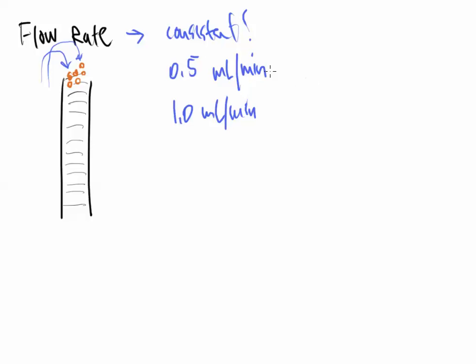The thing that you have to keep in mind is that as you increase the flow rate, you are making things speed up through the instrument quicker. If things go through the instrument quicker, you're going to get some resistance, and this will increase your pressure of the machine as well. Higher flow rates, higher pressures. That's just the way that it is.